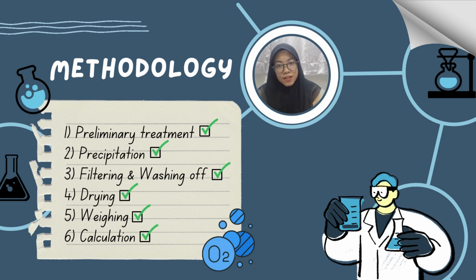Hi, my name is Farah Wahida binti Arifin. I will continue with the methodology for gravimetric analysis. There are 6 steps: preliminary treatment, precipitation, filtering and washing, drying, weighing, and calculation.